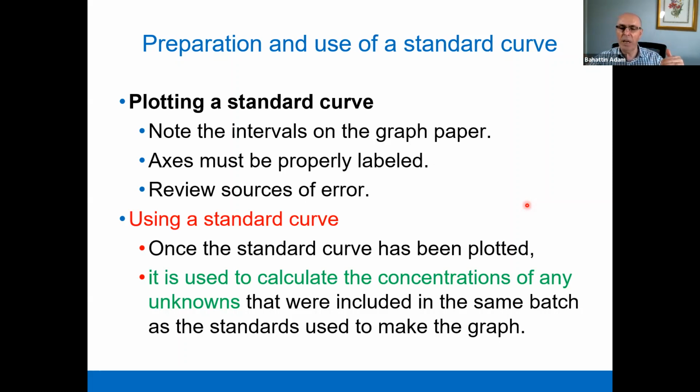We measure the absorbance of each standard and then plot a graph with the different concentrations. It should be a straight line.